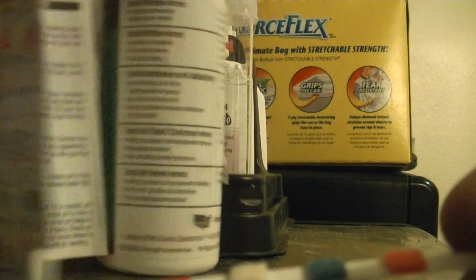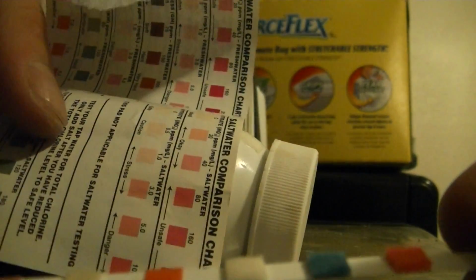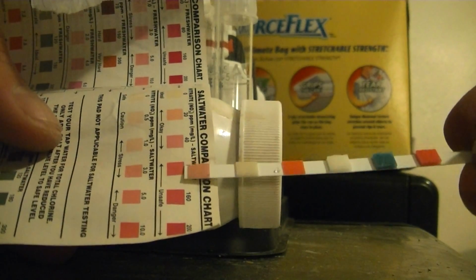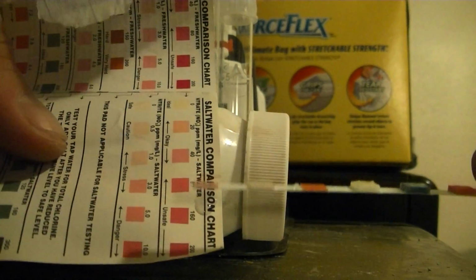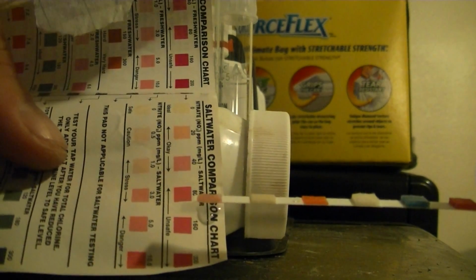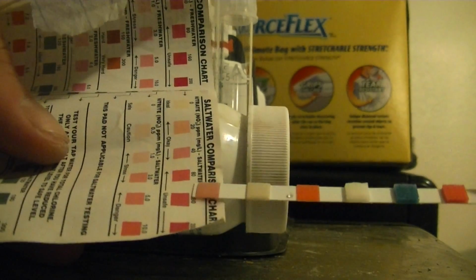So they have a little color key here. And the only one we're going to look at is the top one, nitrate. So that's this one. And we're going to try to match it up, but we still got to wait about 10 seconds. So at 2.5 minutes here, we'll look at what it compares to.